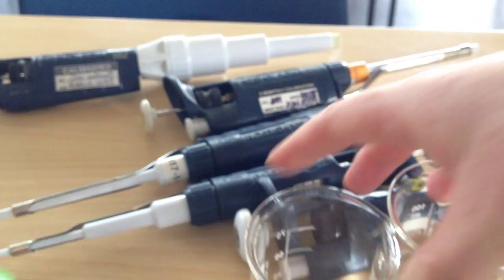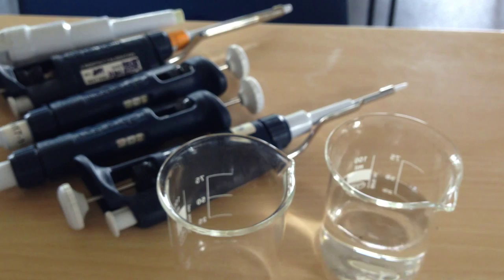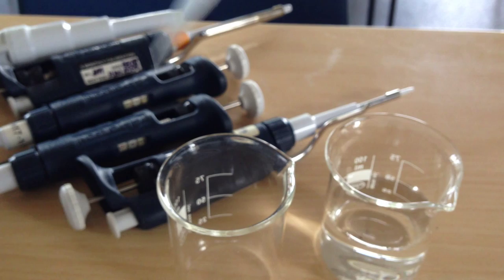So now I'm going to show you how we actually use Gilsons. Here I have some beakers of water. So I've got my P1000. I'm just going to pop a tip on the end there.